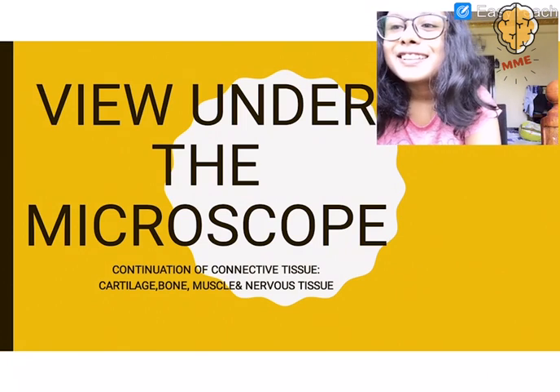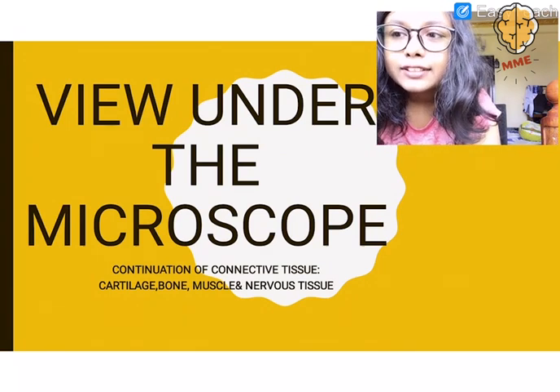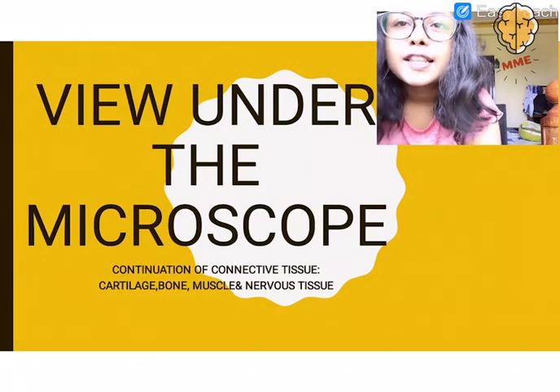Today's topic will be a continuation of the connective tissue that we studied in the third video. Today we will be discussing the cartilage, the bone, the muscle, and the nervous tissue.